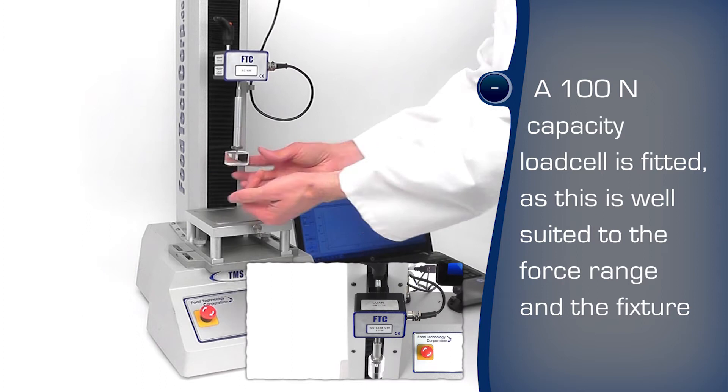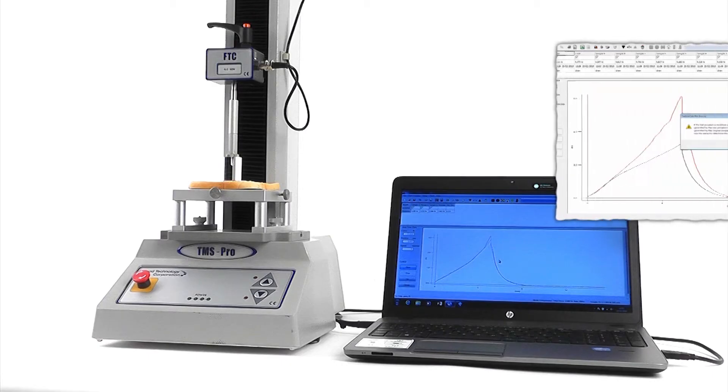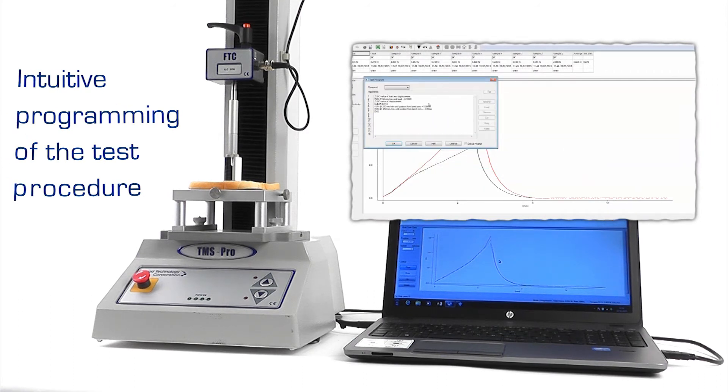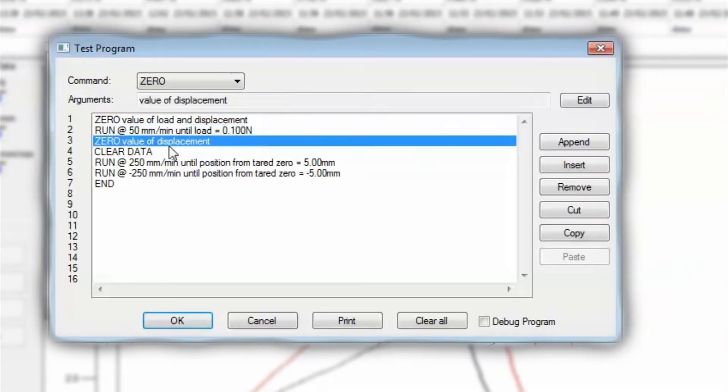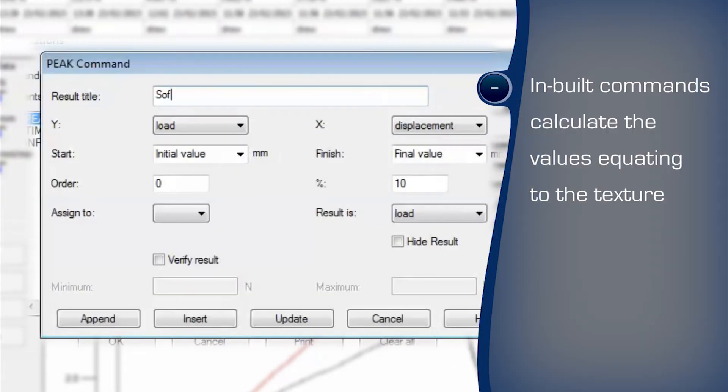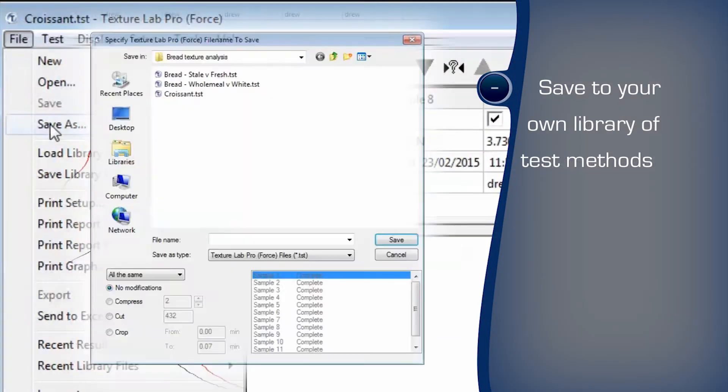A suitably rated load cell is used to maximize measurement accuracy. The automated test program is easily written with the familiar Windows-based environment. Commands are selected to perform the steps. The bread's firmness is calculated from the peak force. The program can be saved to a library and recalled for reuse.